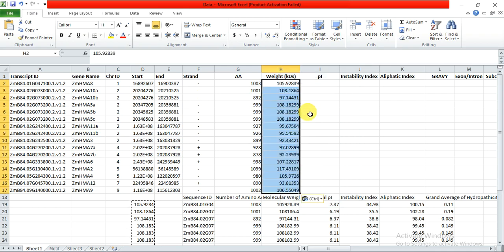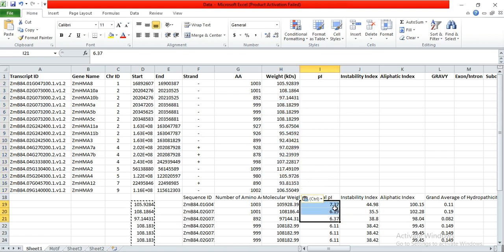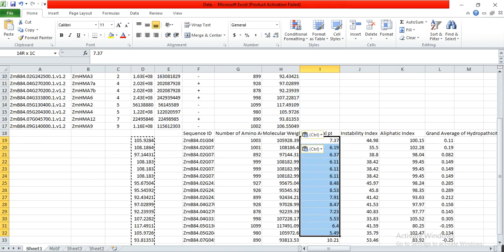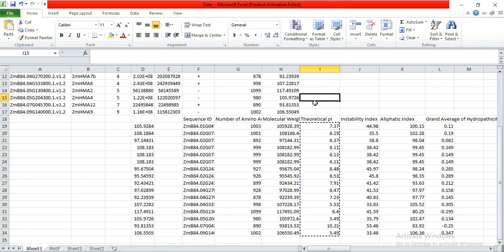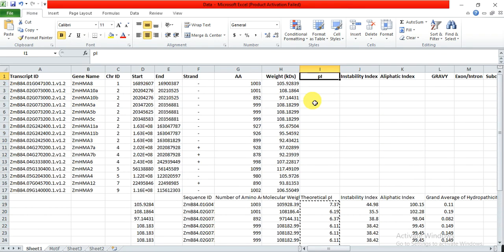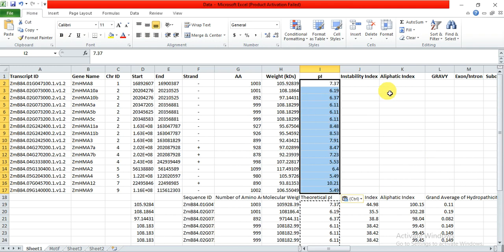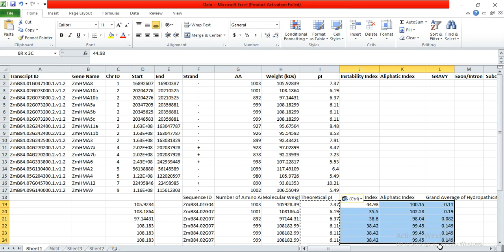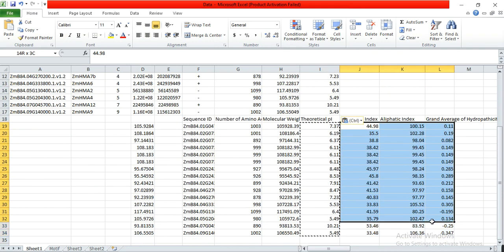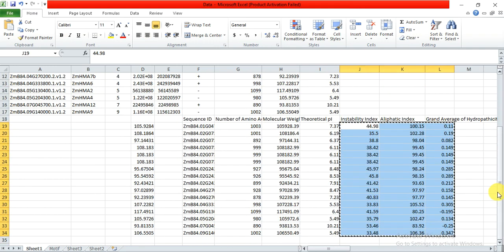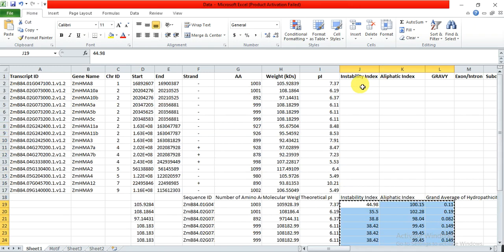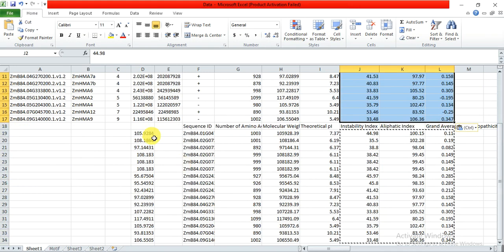If you don't select Paste Values, your values will become wrong because the formula will change. Here is the isoelectric PI values column — copy and paste it. Then for instability index, aliphatic index, and GRAVY, these are three columns, so copy all three columns, paste them, and delete any extra columns.